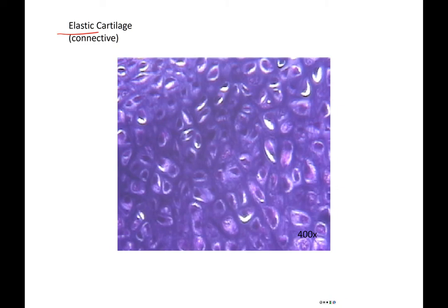The elastic cartilage, notice you can still see those lacunae with those chondrocytes, but there's a lot more of them and they're very densely packed together. Notice how darkly purple this slide is, and remember that tells us that there are more fibers and it's a little bit tricky to see the fibers in this picture but they're kind of spread throughout like this. The elastic fiber is going to be found in the cartilage of your ear, so you're going to see it there.